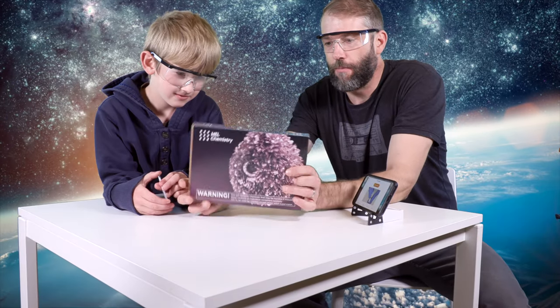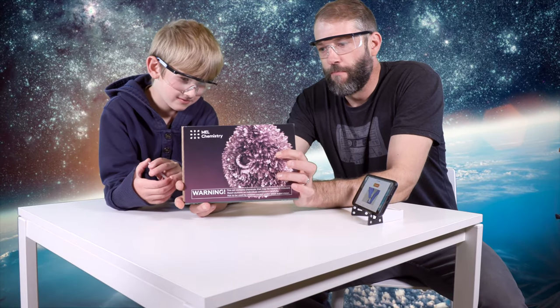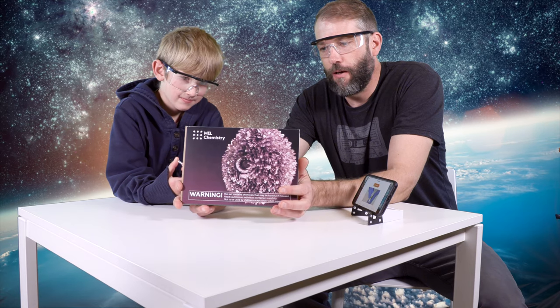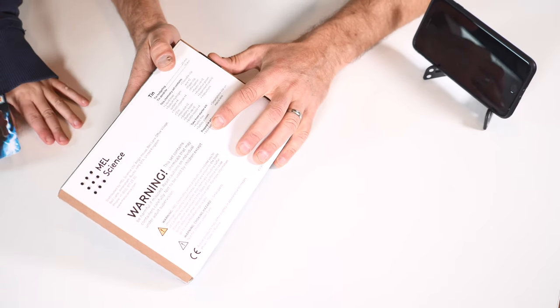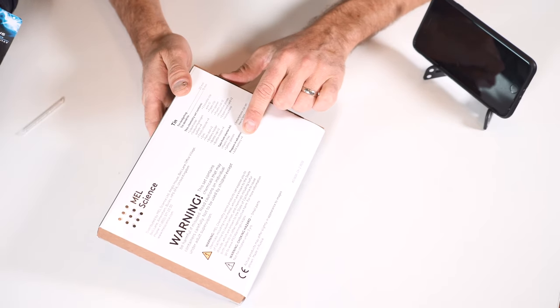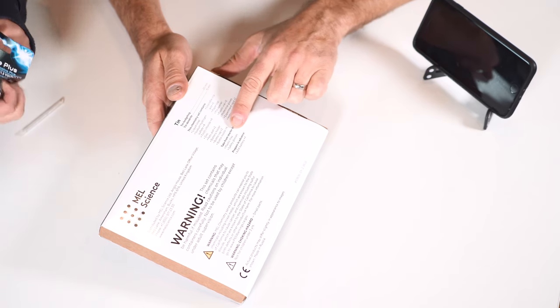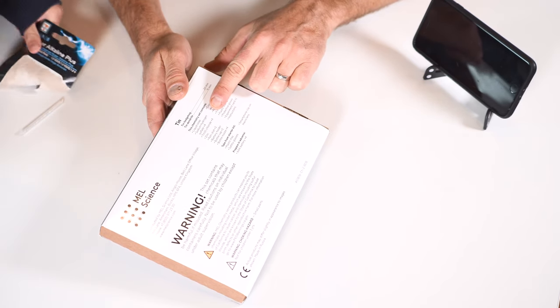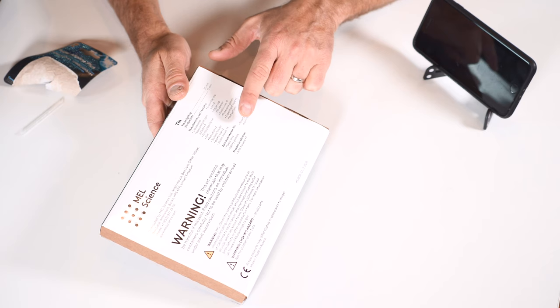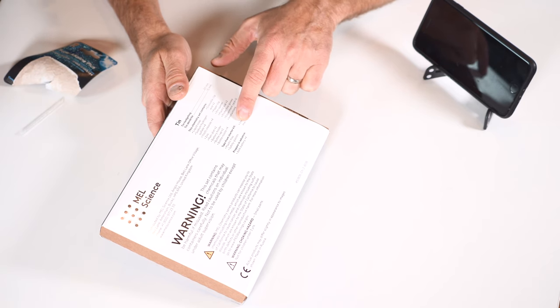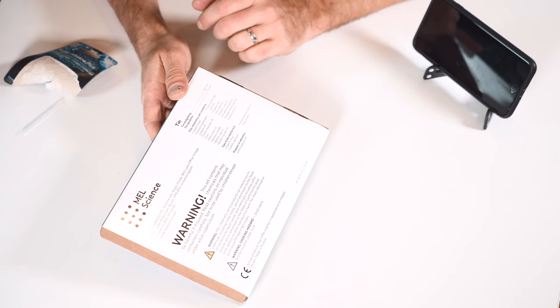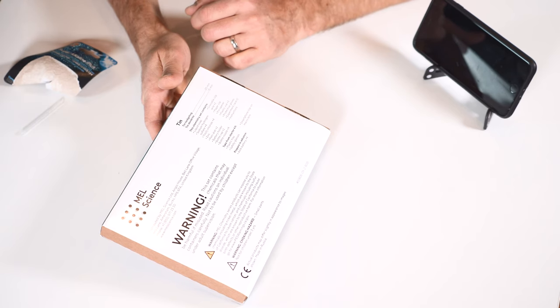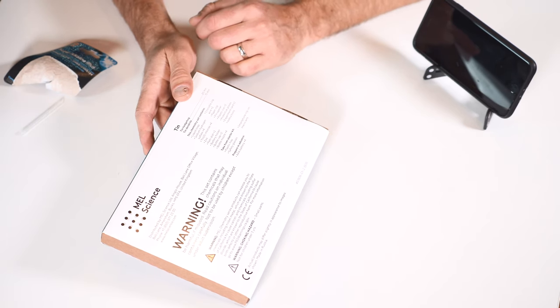This kit, like many of the kits, comes from M.E.L. Science with everything you need to do this one experiment or the one or two experiments that are in the kit. On the back here it shows the things that you need to prepare in advance and the things that you're going to need from this chemistry kit and the things that you're going to need from the starter kit.